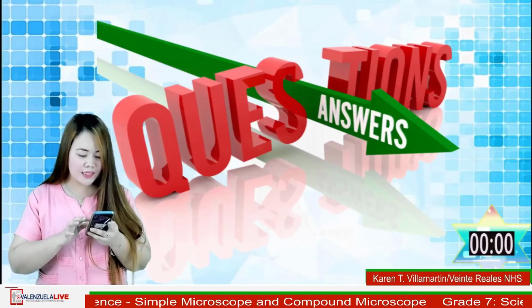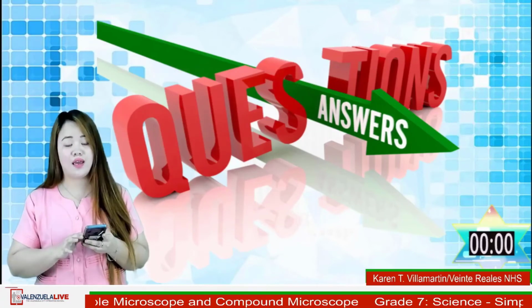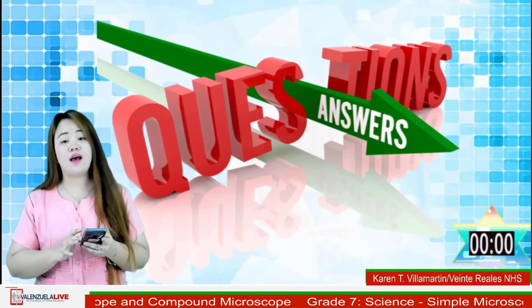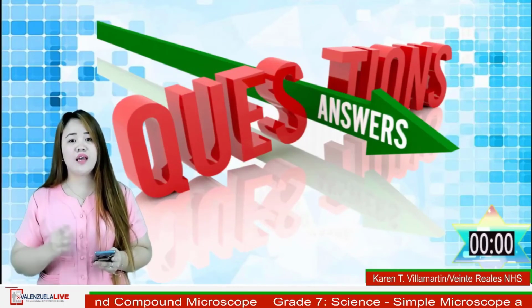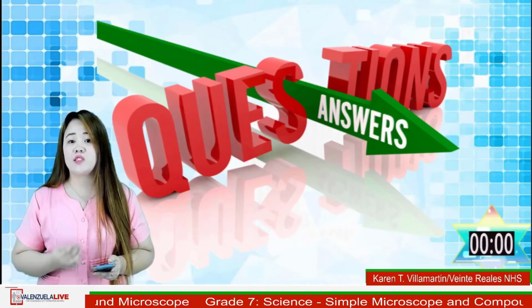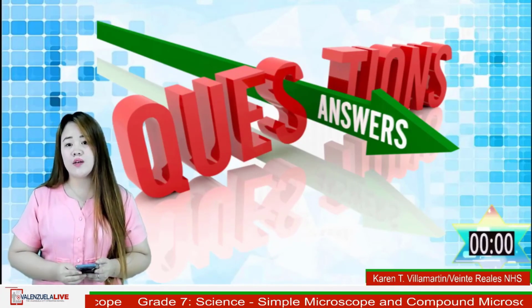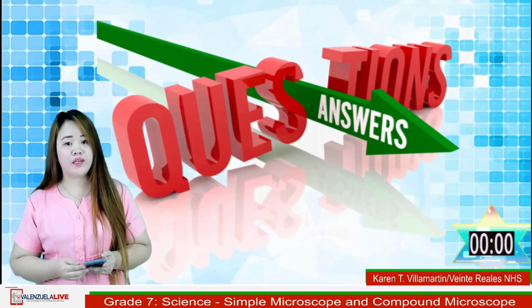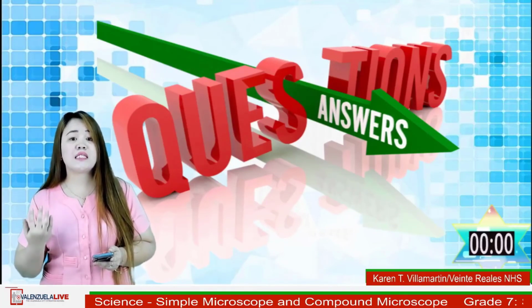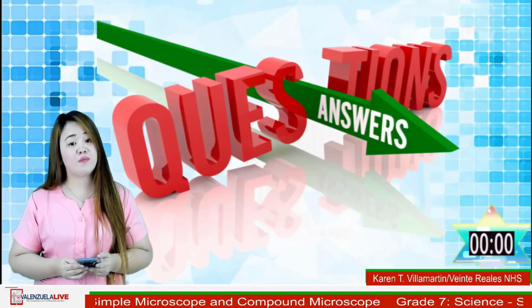And our last question is from a student in Veinte Reales National High School. Ma'am, what is the importance of microscope for us as a student? So in the classroom, microscopes are used to teach students about the structure of things too small to be seen with the human eye alone. Also, the way in which microscopes work can be used to teach students about the properties of light, the physics behind lenses and mirrors, and staining techniques for various specimens.